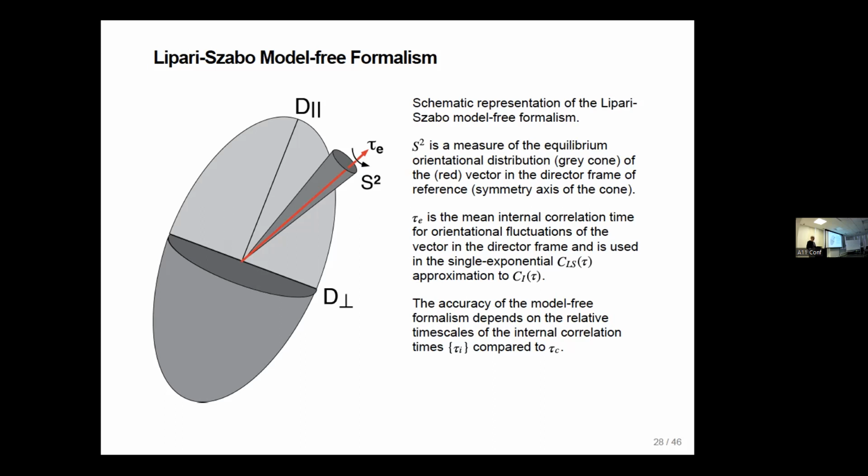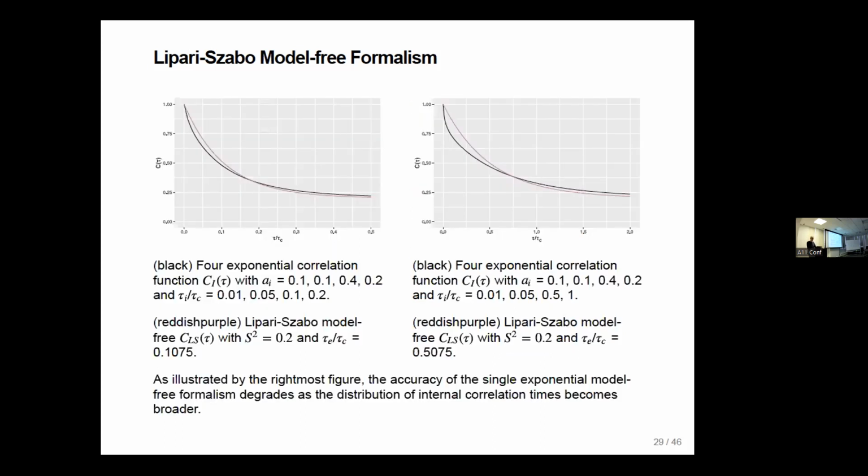And we have a device downstairs here for doing it that we're also trying to make progress on. Well, it seems simple. The difficulty is while you're moving the sample and the magnetic field is changing, all of the relaxation rates are changing. You have to integrate the effect on the spin system while you move the sample. But to do that integration, you have to know the dynamics of the molecule. But you're trying to learn the dynamics of the molecule by doing the experiment in the first place. So it's a very circular problem, but there's still work to do.